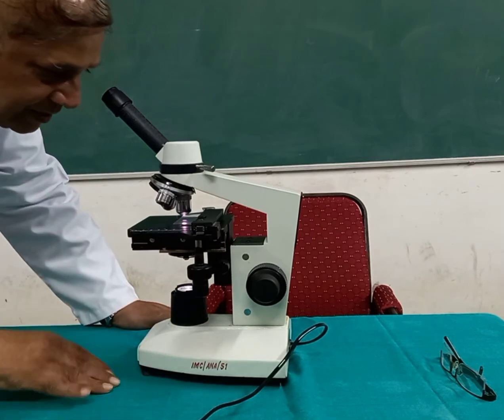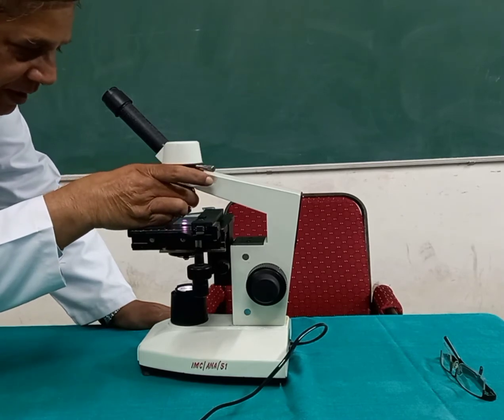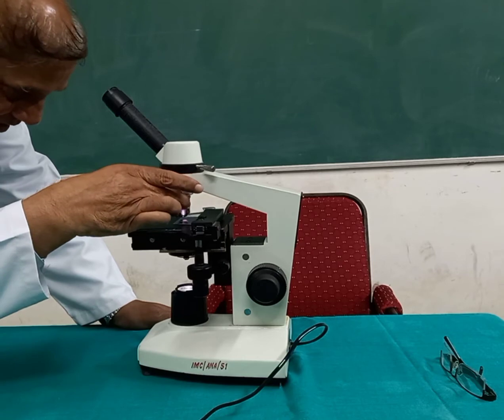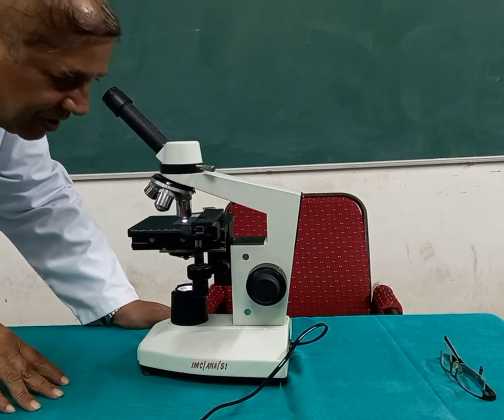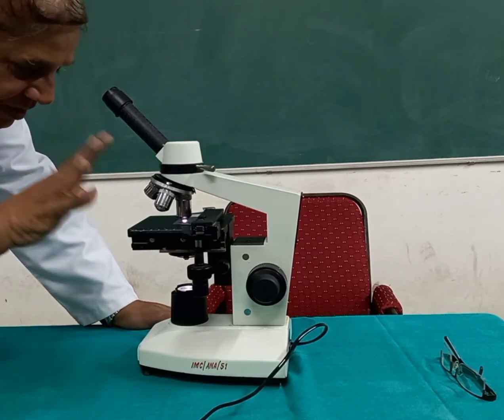If you want to see a still bigger image, then you will have to go to the higher magnification, and this higher magnification is here, the 40x objective lens. These lenses are the objectives. Just move this lens to the 40x. Again, when the click comes, it means your 40x objective lens is in line.